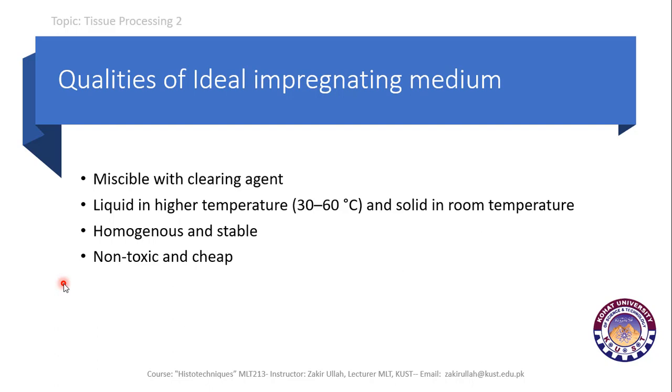The ideal impregnating medium should be non-toxic and non-corrosive to the person working with it, and it should be cheap. Cost effectiveness is also an important factor in every aspect of labs and tissue processing.